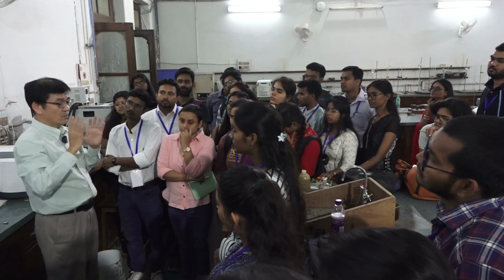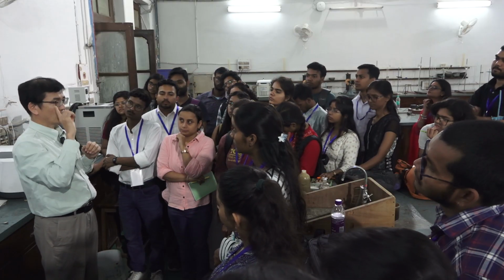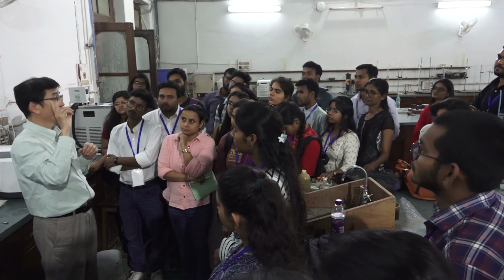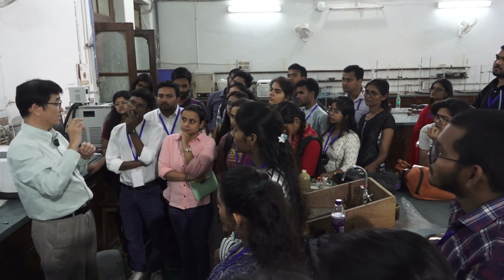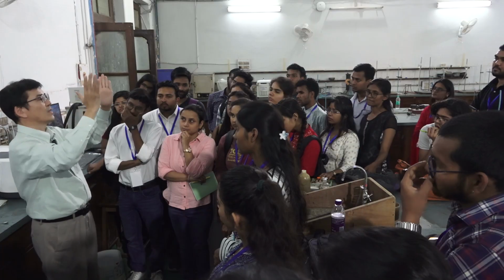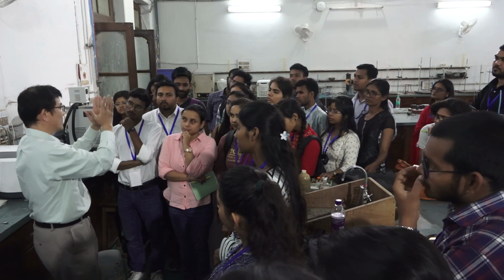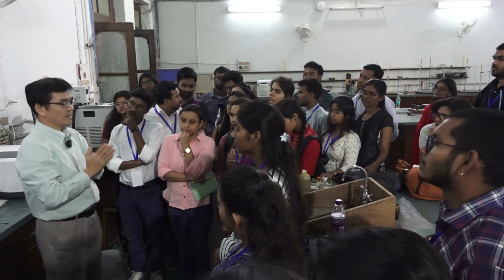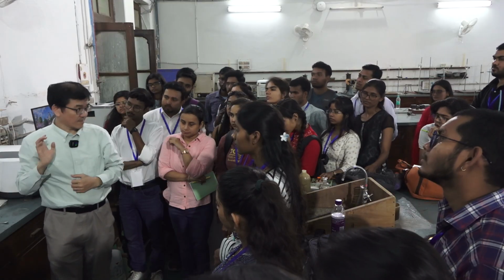So we need to measure twice: the sugar aqueous solution, and H2O. And we need to make it exactly the same length. It's difficult. In that sense, this is very advantageous.